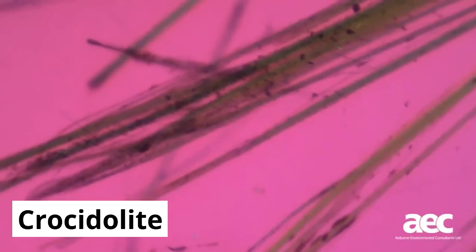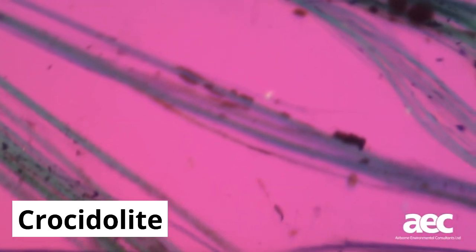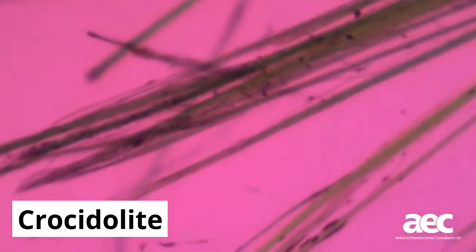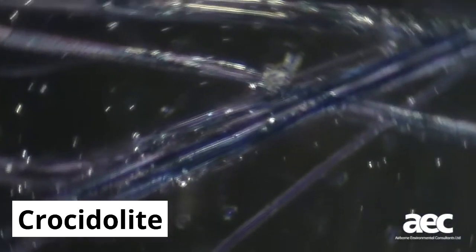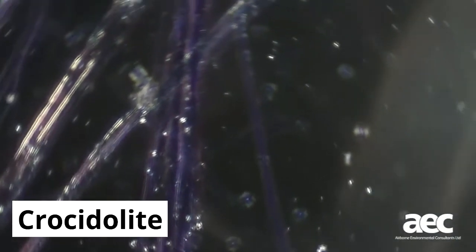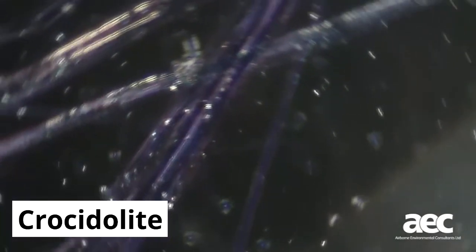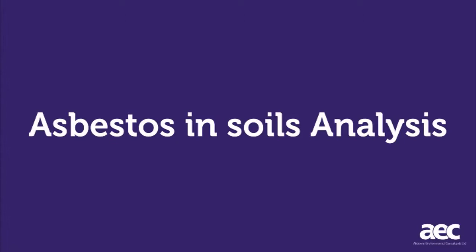Next is the sign of elongation, which in the case of crocidolite shows the blue-coloured fibre in an orientation opposite to that we saw with amosite and chrysotile, indicating light can travel faster down the length of the fibre than it can across its width. Finally, the dispersion staining test shows a fibre that is changing between two shades of blue, indicating a match between the fibre and the mounting liquid, confirming the fibre is crocidolite.